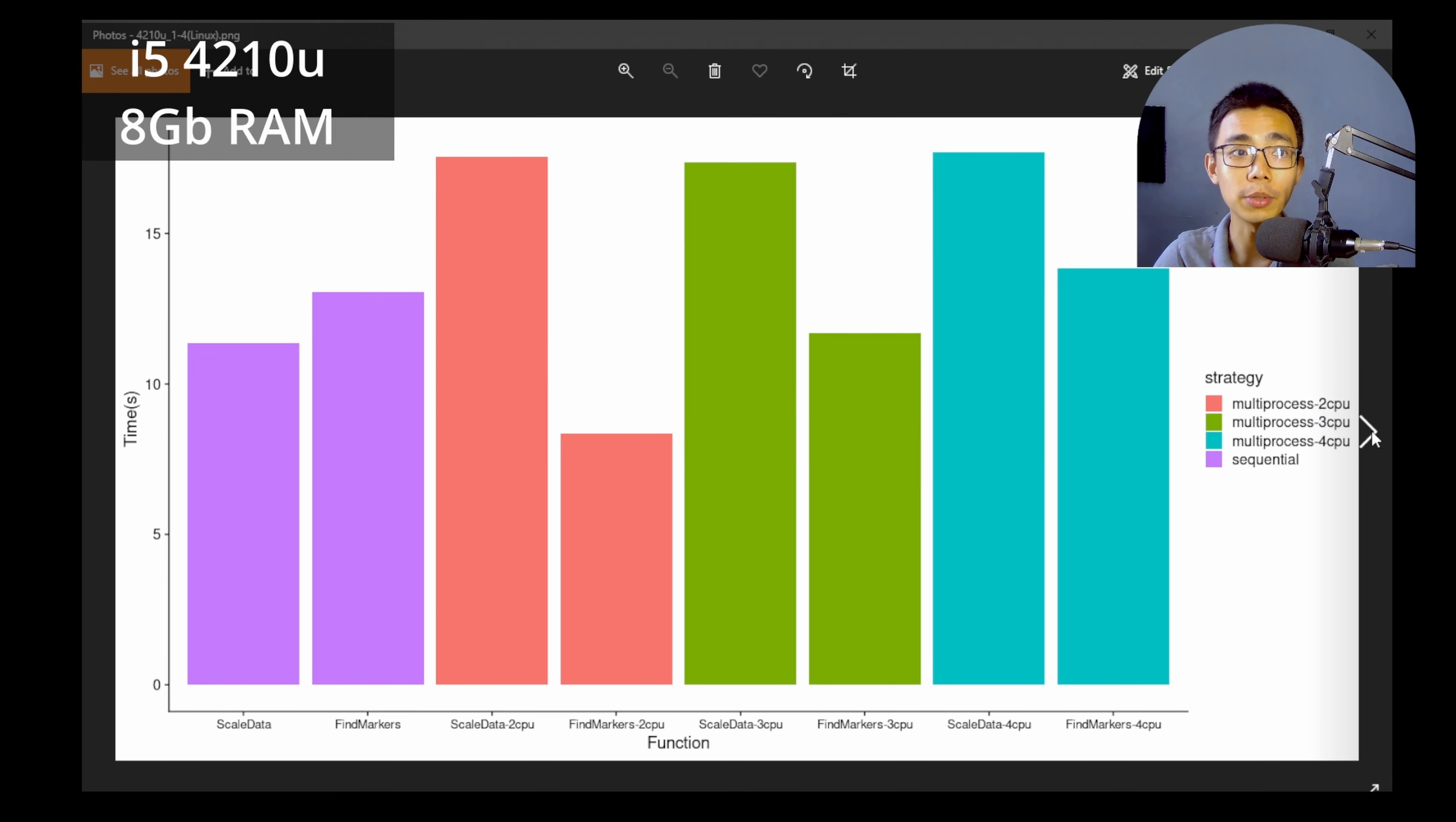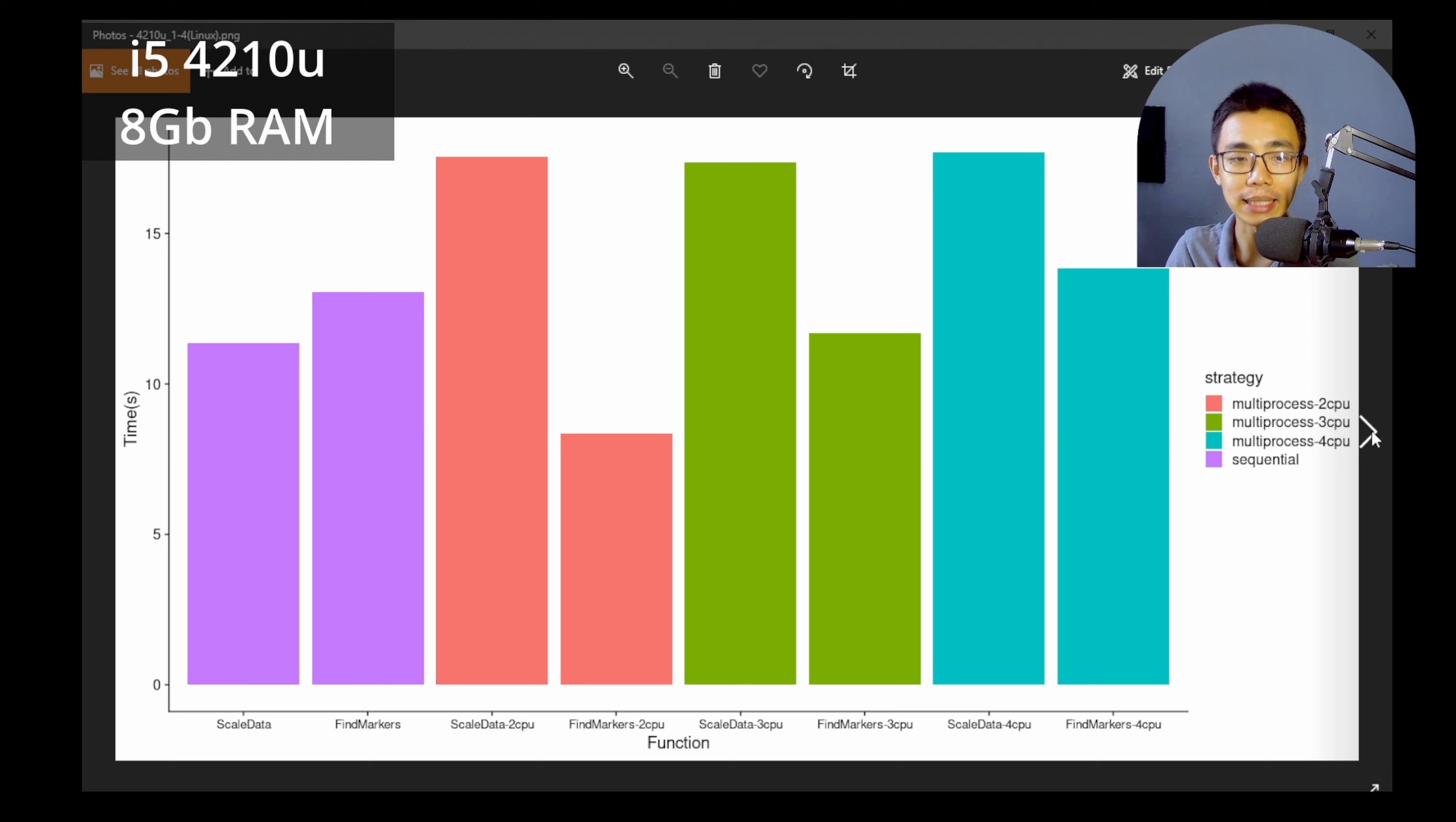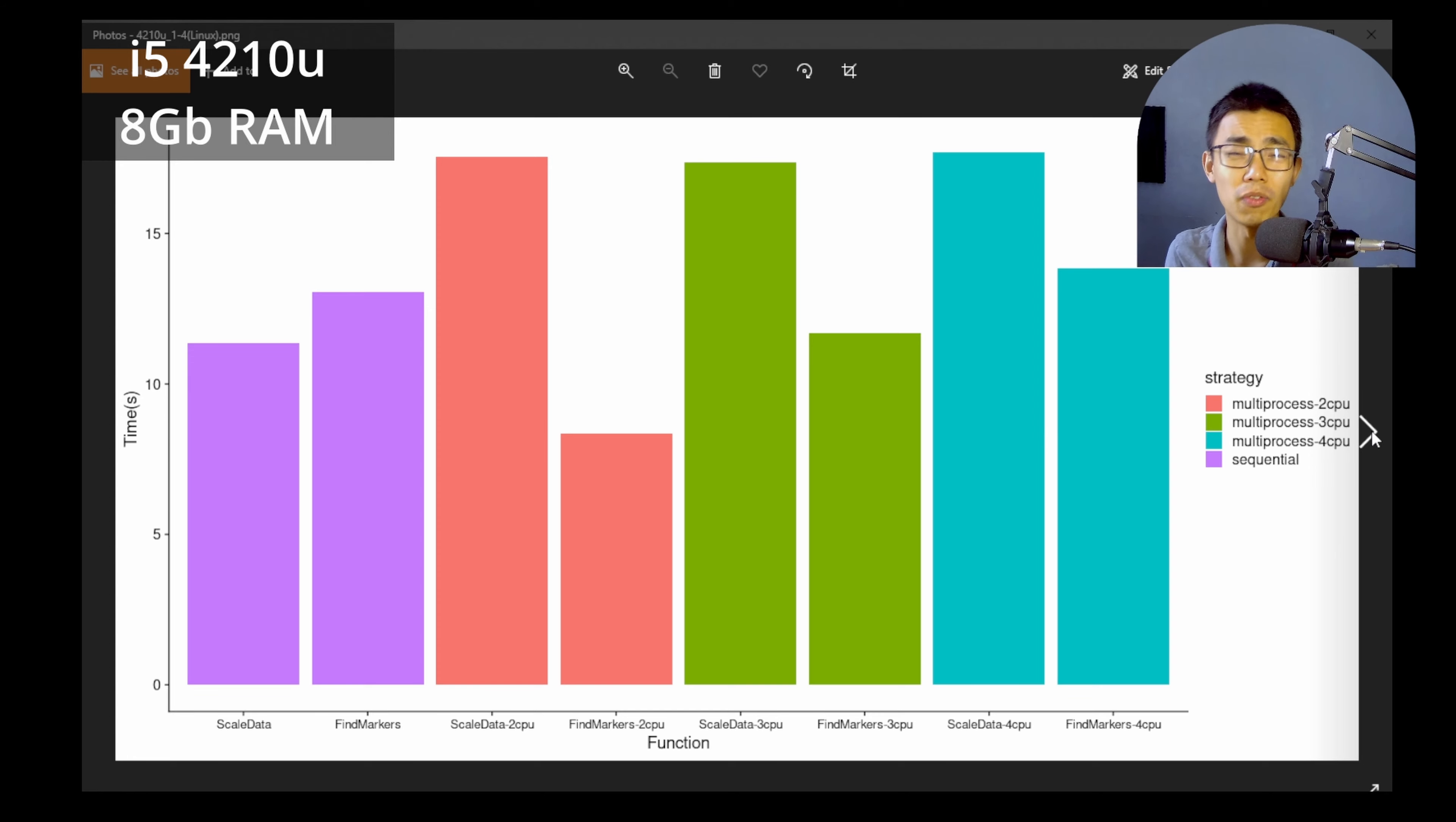So I also did the same thing with my laptop, which is actually a Pop!_OS Linux laptop with 8GB of RAM. So as you can see that scale data does not, yeah, does not actually benefit from multi-threading, actually suffers from it. But again, find markers has a very, very similar trend. It's faster with two CPU and it's slower with four CPU cores.